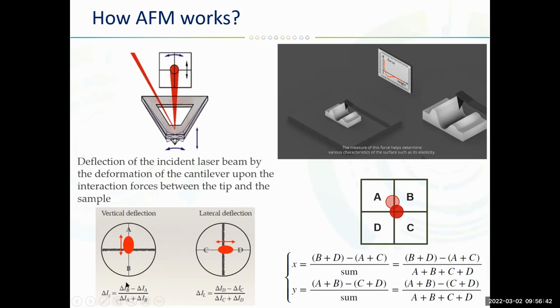And these are the current intensity of the signal in different parts. Originally there were only 2 parts, but nowadays we usually use a quadrant photodetector. The center of the entire detector outputs 0 volts. But as the laser spot moves to a different radial distance from this center point, the magnitude of the output voltage will increase in a linear way. So here X and Y: X is horizontal movement, Y is vertical movement.